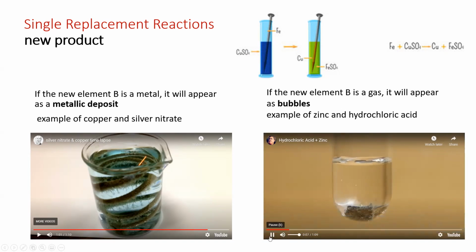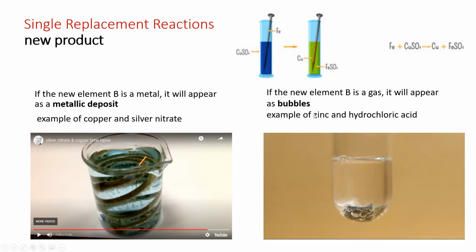And that's not from mixing it. Those bubbles are the product. And so when you see bubbles, that's an indication of a formation of a gas. And the gas that's formed is hydrogen gas. And so we could do this by writing out the products, doing the crossover rule.